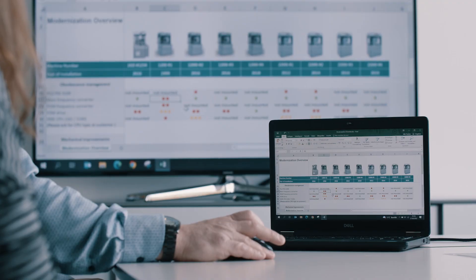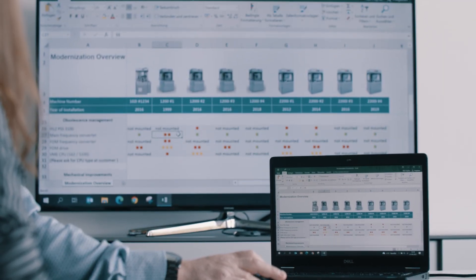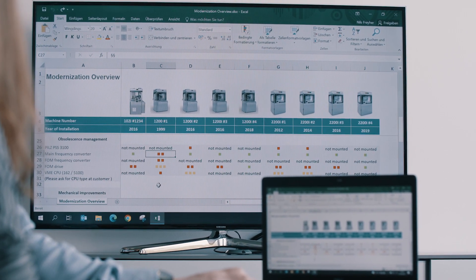Let's have a look at an example. Some machines can be equipped with a new dust-tight tablet shoot. The overview shows for which machines this upgrade is reasonable.